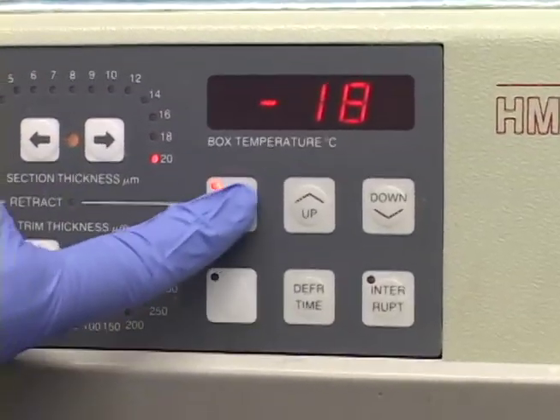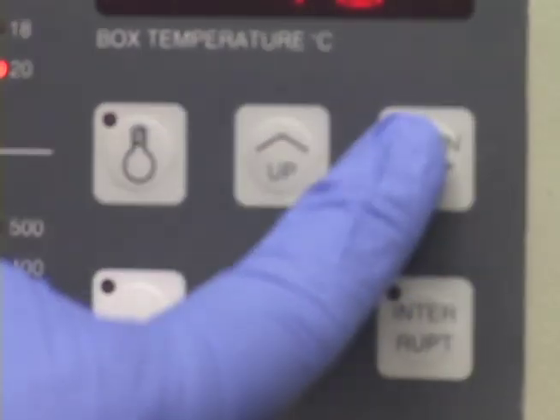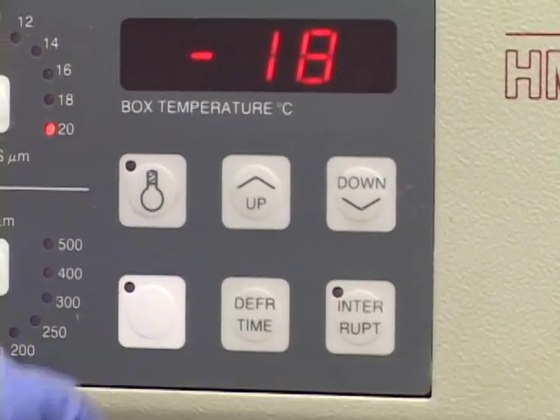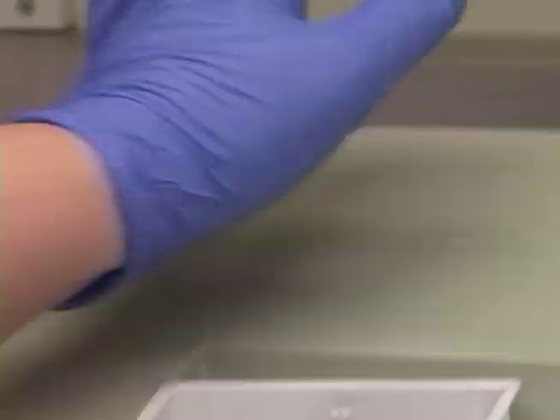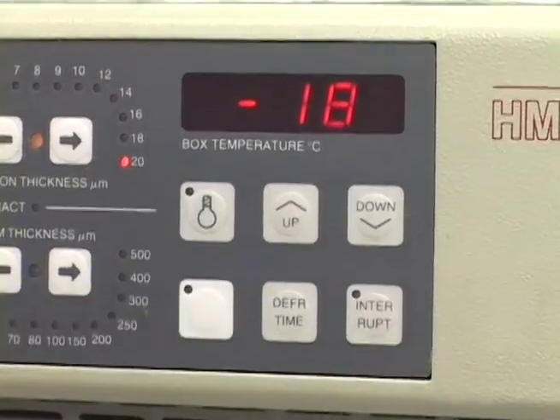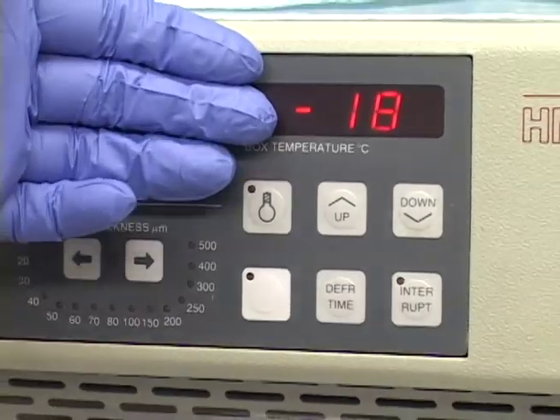Our light is not working right now — we need to get a bulb for it, but that's the light button. If you need to set the temperature, you can set it here. That's the actual set temperature. When you first turn the machine on with the switch in the back, you're going to see an E03 error code. You're going to push that and it'll retract all the way back and the E03 error code will disappear.